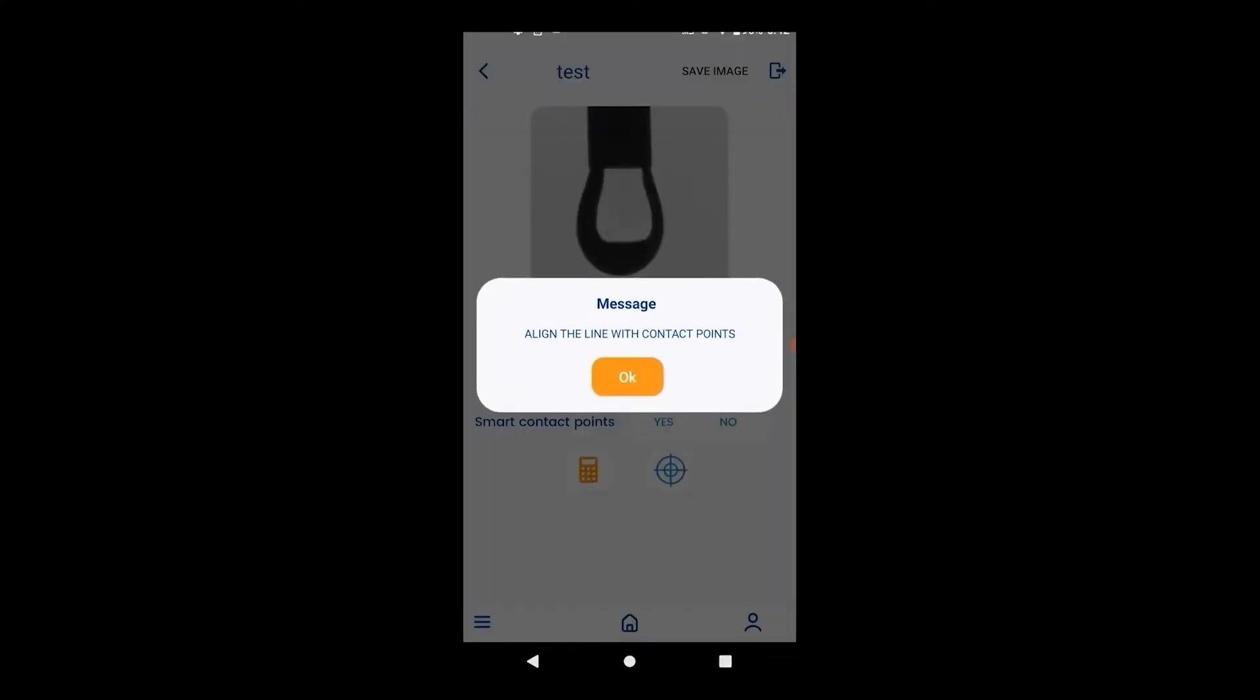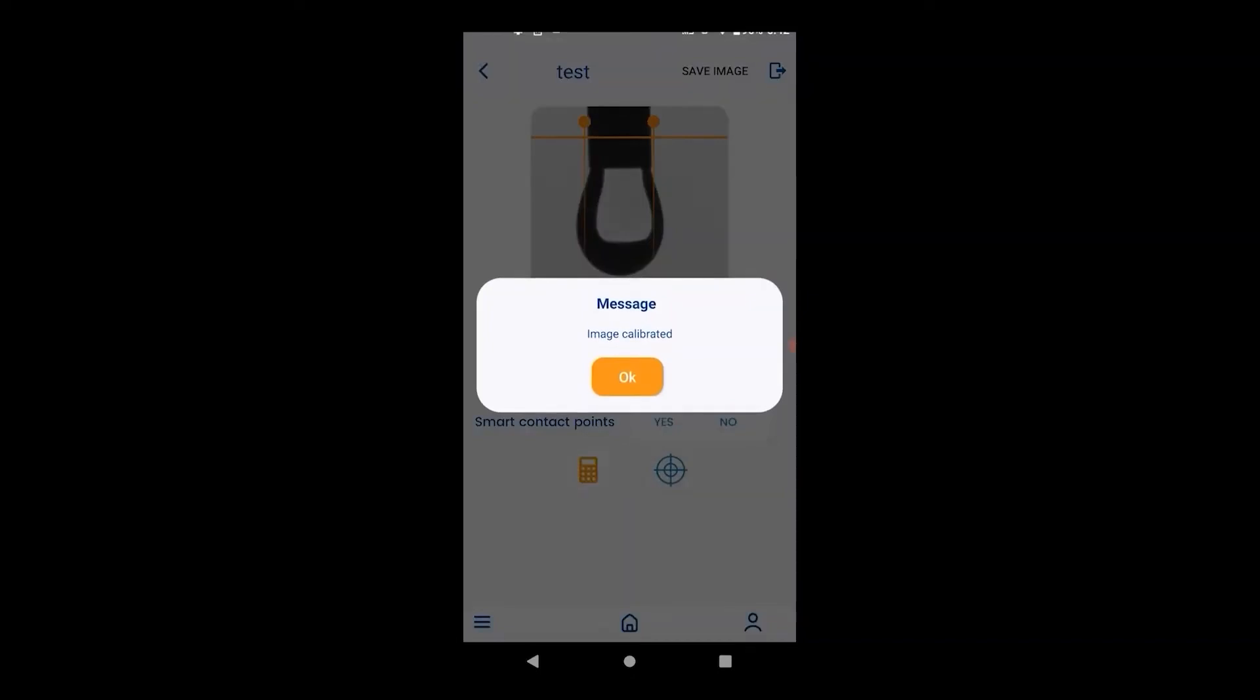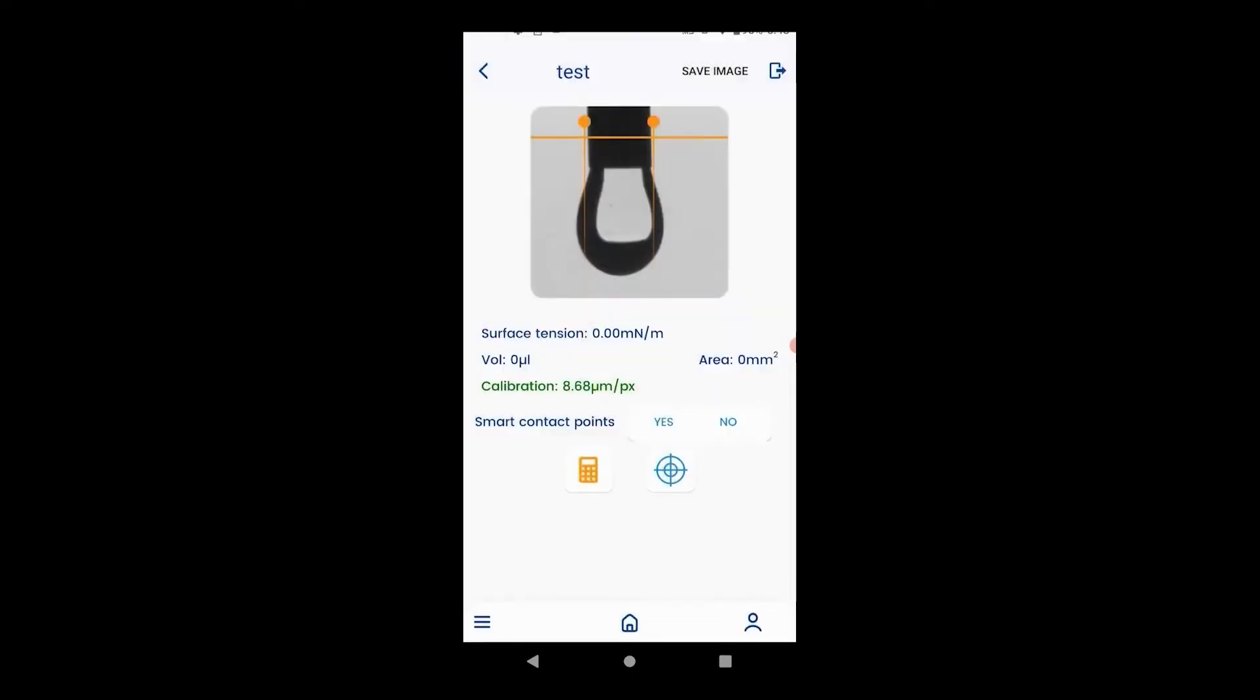Move the orange points to the left and right of the needle and hit calibrate. If the calibration number is green then the number is correct. If it's red or yellow then something is wrong. Generally the lower the calibration number the better.